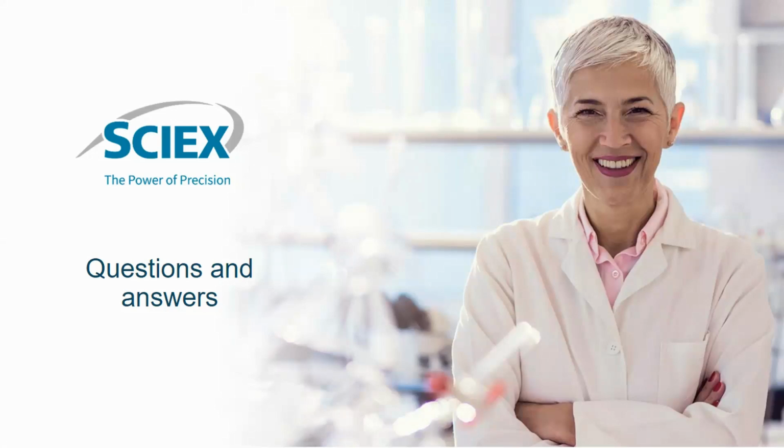All right, we've already got some great questions in the queue here. So this first question, Philip, asks: why would I want to use the BioPhase driver for compliance? And how do BioPhase and the driver help us with compliance or regulated environments?